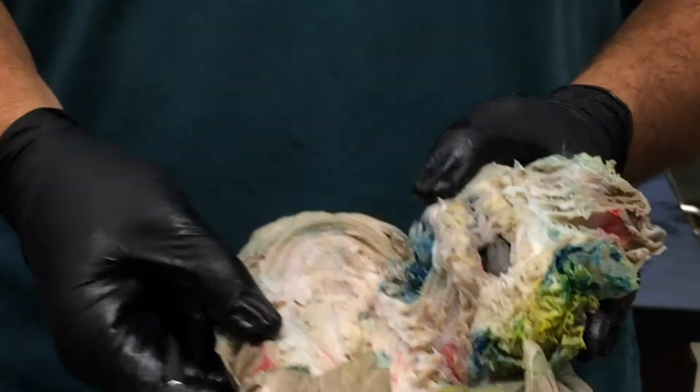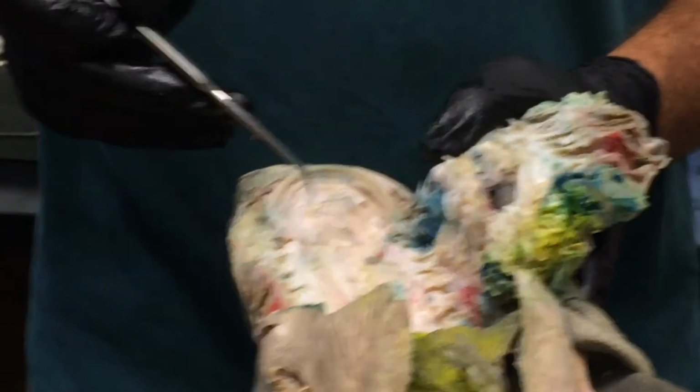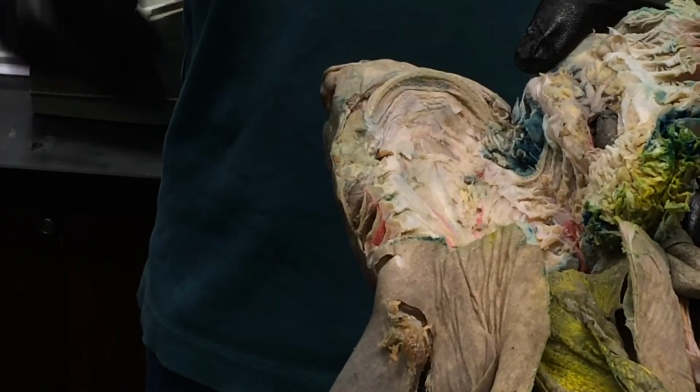Did you see that on right? Okay. And the only other thing I'll point out is that if you do go and start peeling away dorsally here, you'll start to see the efferent branchioles, but that needs to get cleaned up more before we could really see that well.